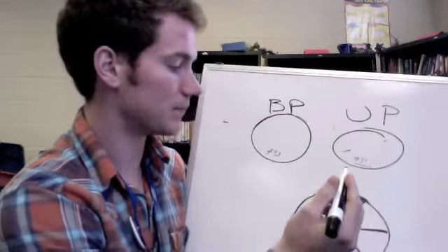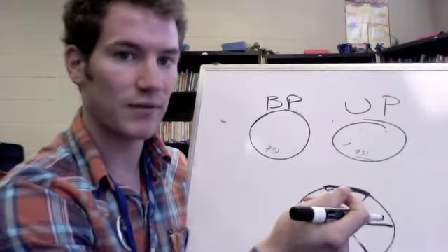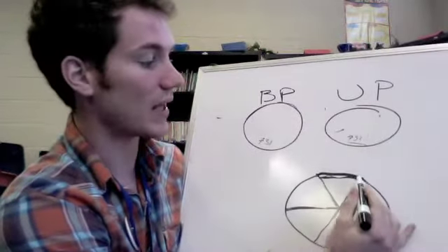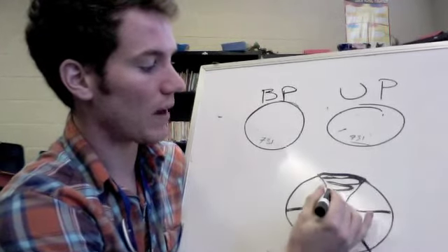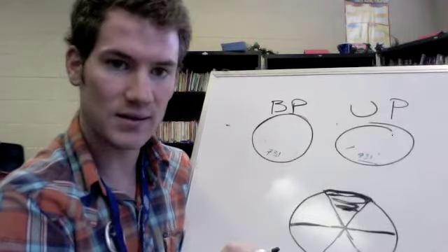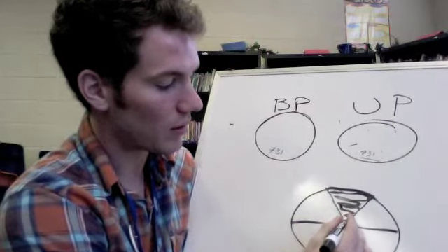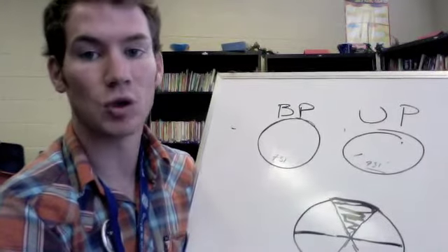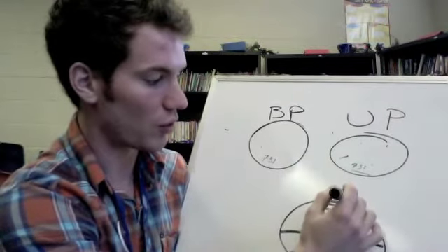And then we'll turn it to the other side of the stick, the side that does not have colony on it. Then we'll take it from right here, and we'll drag that down, and then go back and forth. About halfway down, we'll get a new stick that has no product on it, and then we'll grab it from right here, and we'll drag it down. Down towards the bottom, it should have less and less growth. But for this one, as we see, it's the unrelated, we're hoping for no growth here.